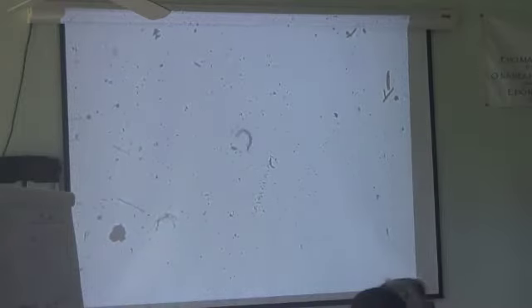So it has our nematode over here. Here it is. He's stuck down. I think I should move the cover slip. There he is, now he's out in the middle. And so, use my iris diaphragm to try to shadow a little bit better. So see how much easier it is to see when I shadow with the iris diaphragm that's on my condenser.